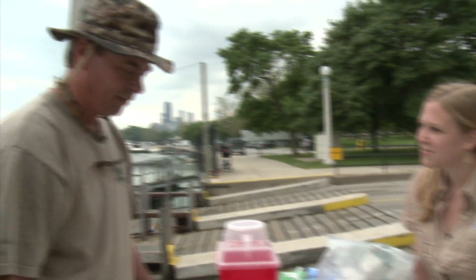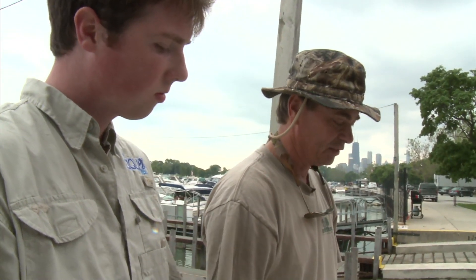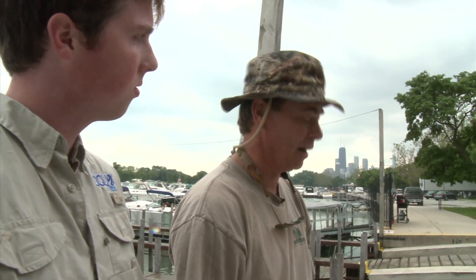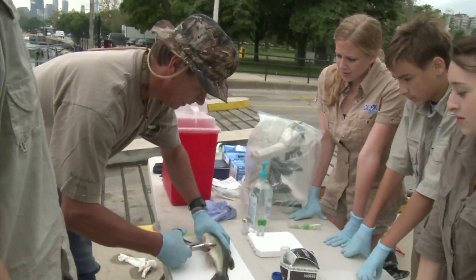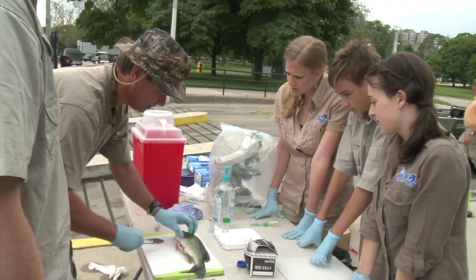Why do we have to do this? We've got some bigger fish that won't fit in the packaging to be UPS overnight air freighted. So we're going to extract the spleen, the kidney, and the heart and just send the organs in. Those are the target organs for VHS testing. They'll be sent to the diagnostic laboratory in Maine and they will test for the VHS virus. We're going to cut a little window out of the fish — we're going to go up to the lateral line, across the stomach, through the isthmus of the gills.